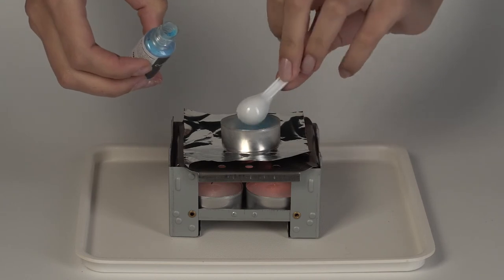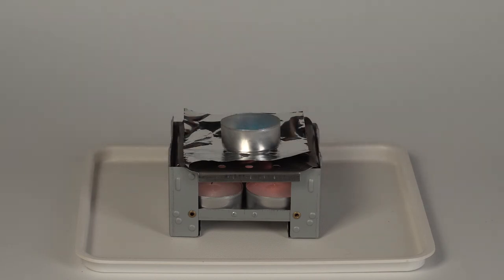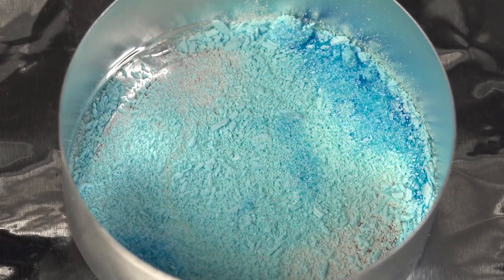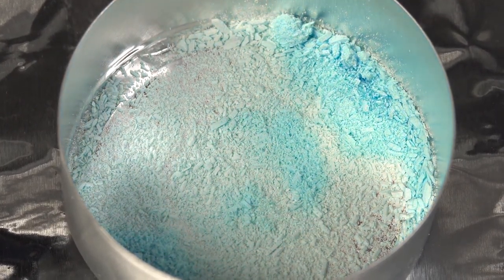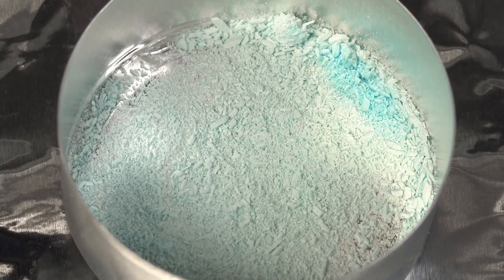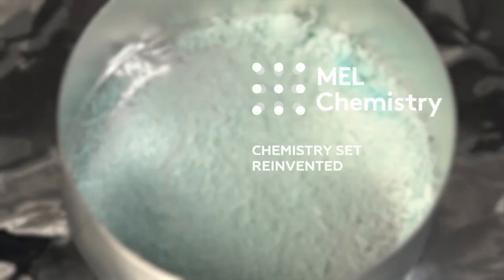Copper sulfate crystals contain water, and it is water that gives them their bright blue color. When heated, the crystals slowly lose water with the result that they gradually turn from bright blue to colorless.